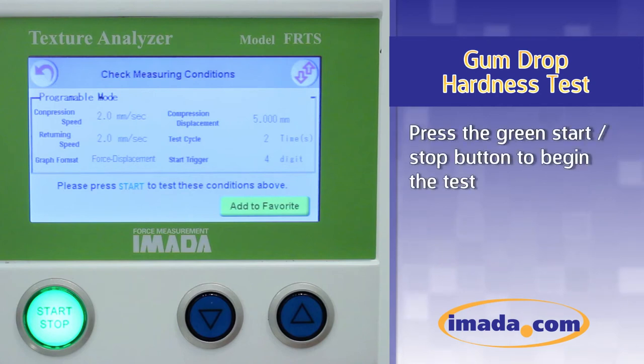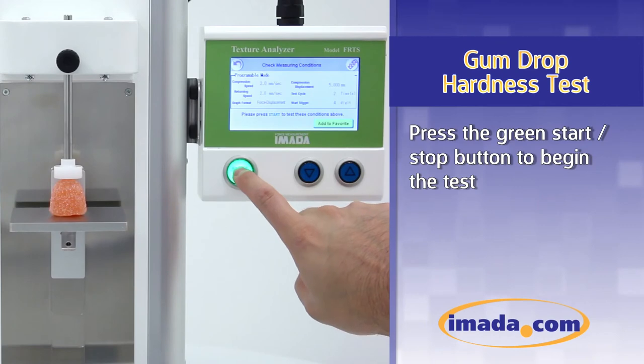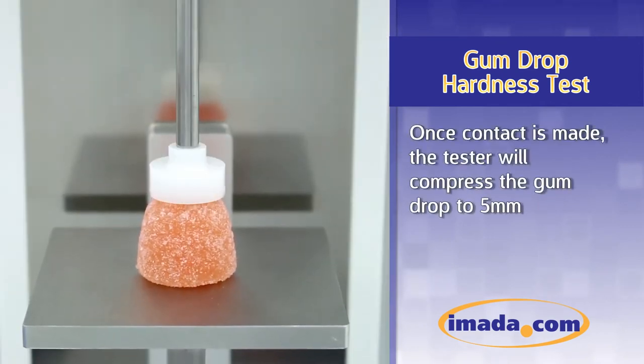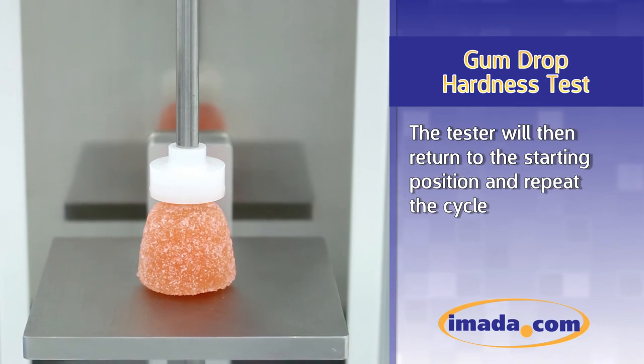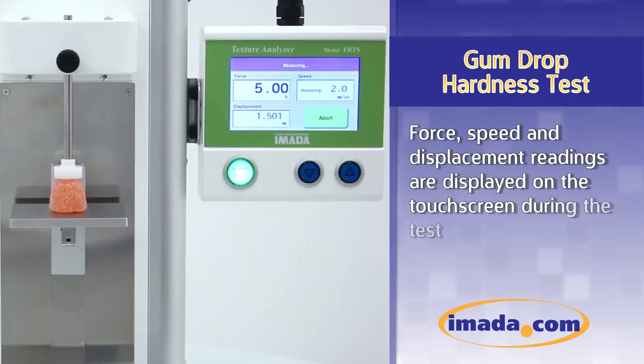Press the green Start-Stop button to begin the test. Once contact is made, the tester will compress the gumdrop to 5 millimeters. The tester will then return to the starting position and repeat the cycle.